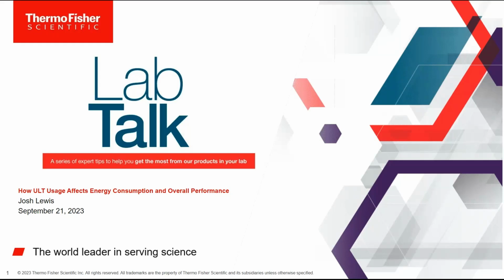And I'm really pleased to introduce our topic today, how ULT usage, so ultra low freezer usage, affects energy consumption and overall performance. Today, I'm pleased to welcome Josh Lewis, one of our experts here at Thermo Fisher Scientific in the world of cold storage. Thank you so much for joining us today, Josh. I can't wait to hear about this awesome presentation.